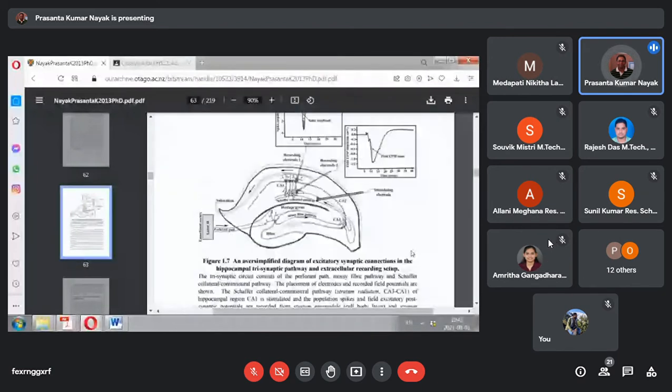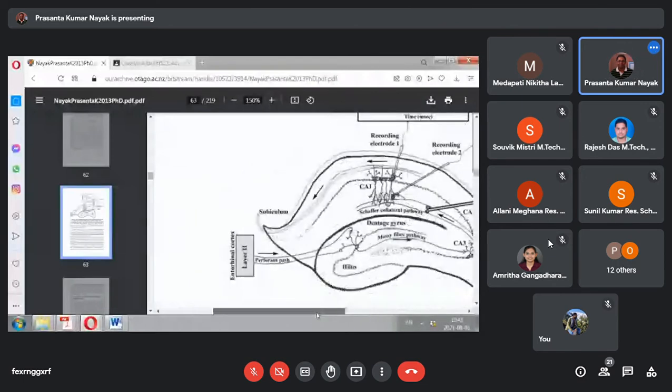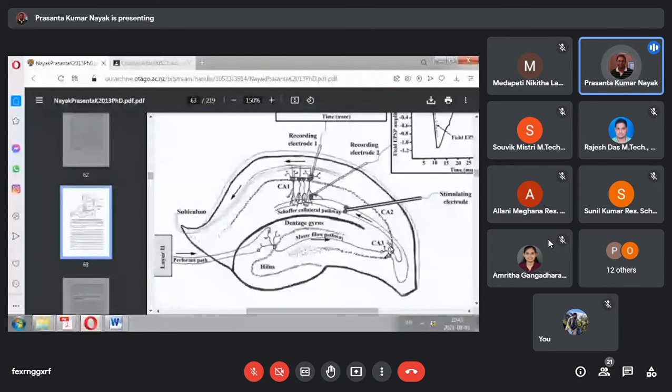Look, this is one of the sections of the rat hippocampus. Rat hippocampus is a banana-like structure. If you look at it, it looks like a slender structure, like a banana. If you cut a banana, you'll see the seeds are arranged. Every slice will have the arrangement of the seeds the same in all. Am I right? Yes, sir. And they are intact. All the seeds are intact.